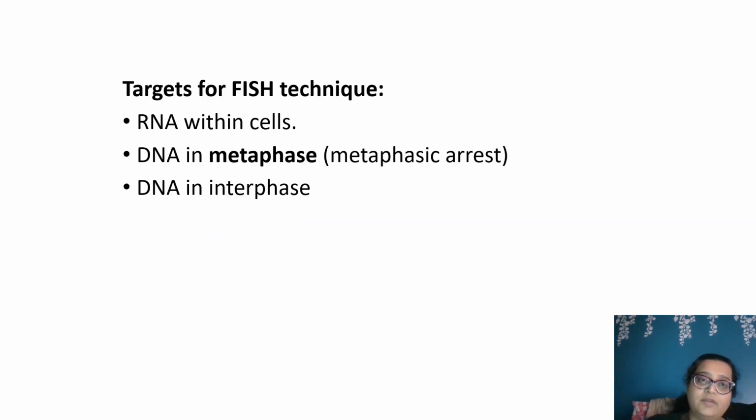What do we target with FISH? RNA within cells, DNA in metaphases, and DNA in interphases.